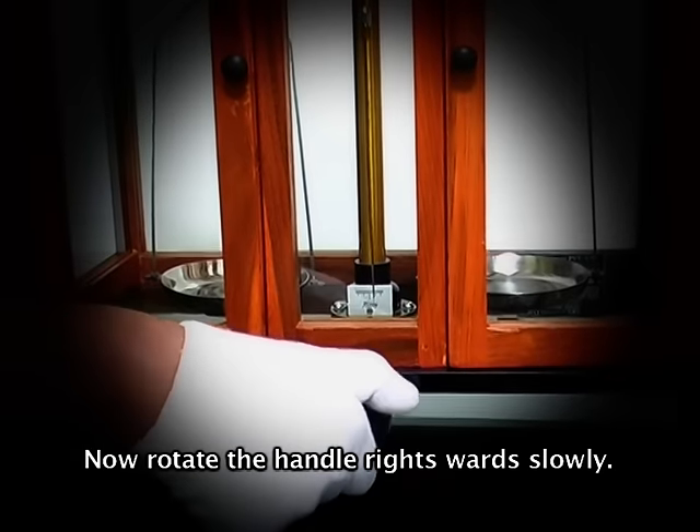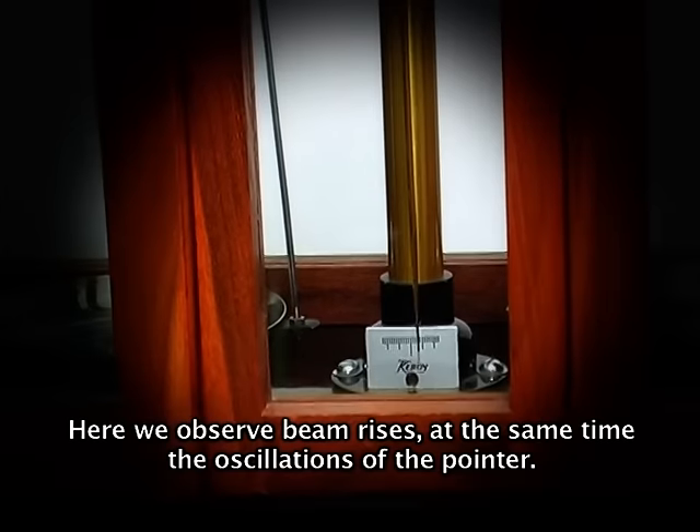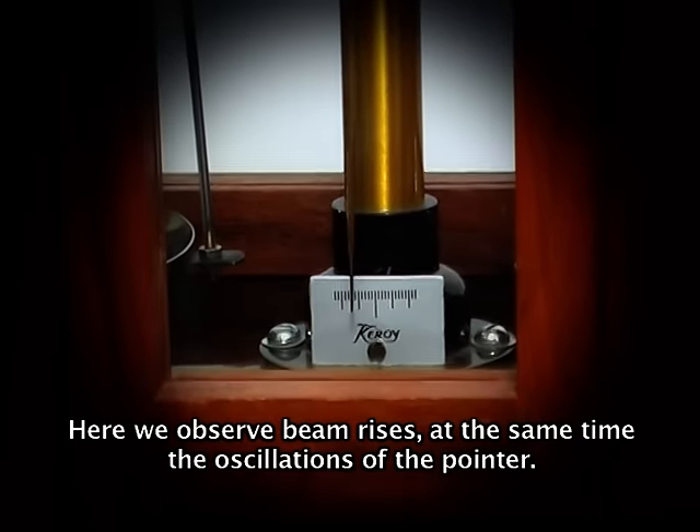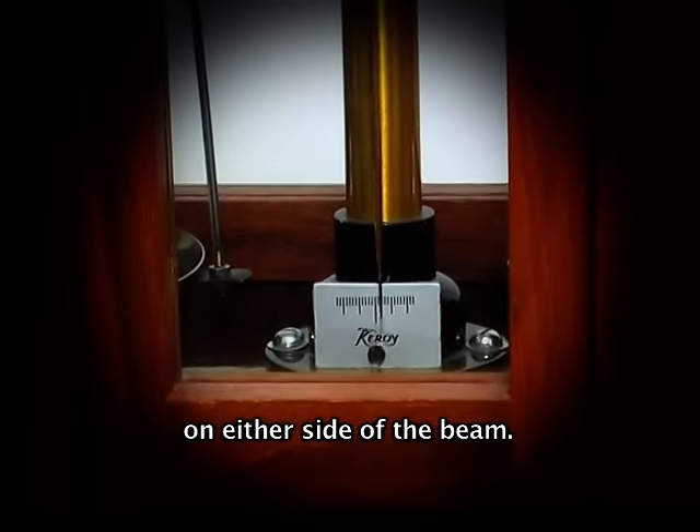Now rotate the handle rightwards slowly. Here we observe the beam rises and at the same time the pointer oscillates on either side of the central division.